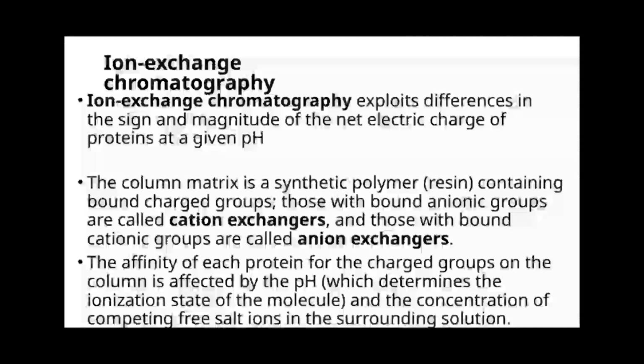Second, the concentration of free salt ions in the solution, which compete with the proteins for binding sites. So, by adjusting the pH and salt concentration, we can selectively bind and then elute proteins based on their charge properties. This technique is powerful because it allows us to separate proteins that might be very similar in size, but differ in their charge characteristics, connecting nicely to our overall theme of protein purification and analysis.